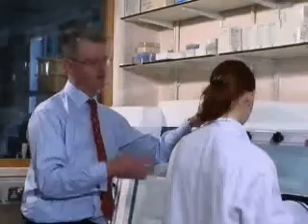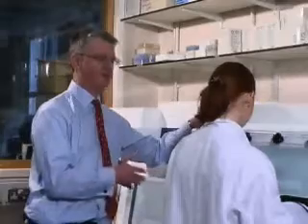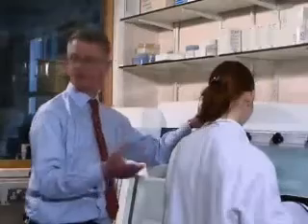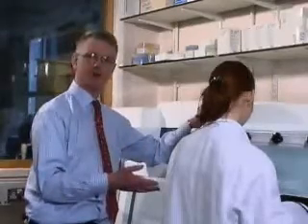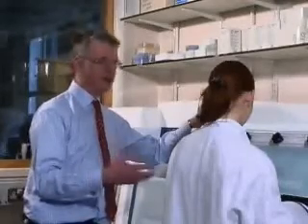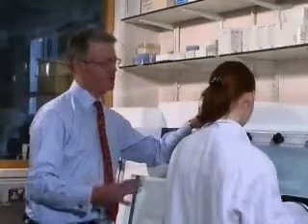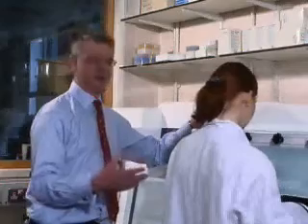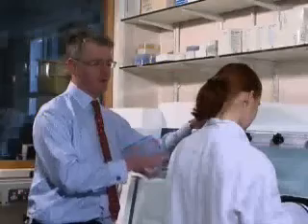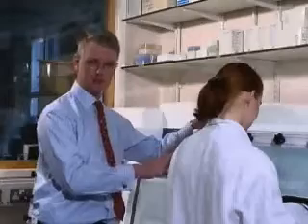The other main use of this is that we can put cells in here for a long time so that they're at a really stable level of oxygen. Otherwise they're changing each time they come out of the chamber when you're, say, splitting them up. And we think that's likely to be important when cells are deciding whether to differentiate or not, for example. So we're interested in differentiation in bone, and we've got a collaborator who's looking at that. And we think that's particularly well studied in a situation where you don't have to change things at all.